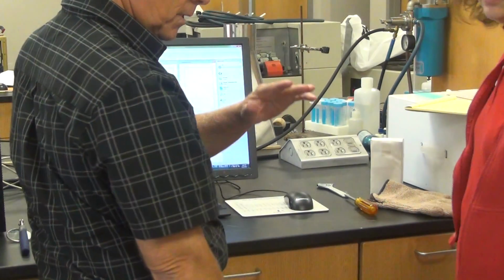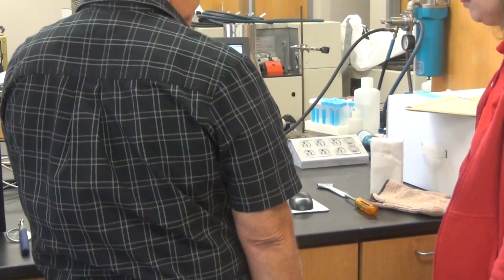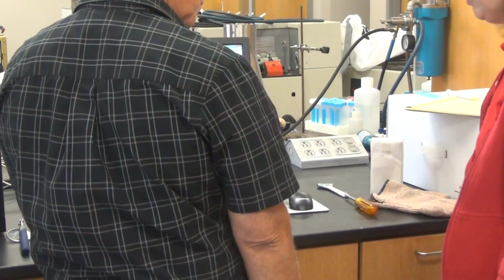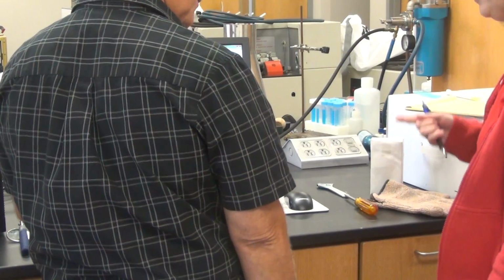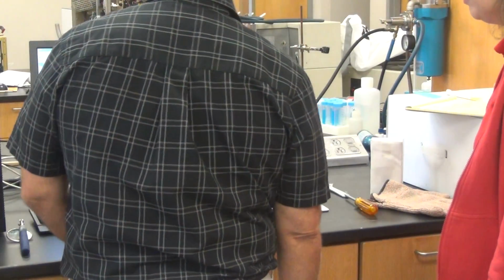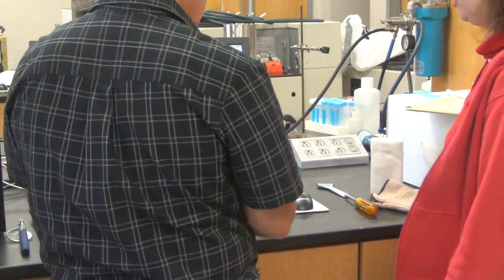just like your other one, it could pick up different volumes, so you could make your auto sampler make other standards. If we have a 10 part per billion, and I want to make a 2.5 and a 5 out of a 10, you do it from here. Matrix modifiers, and you all still remember that, okay.